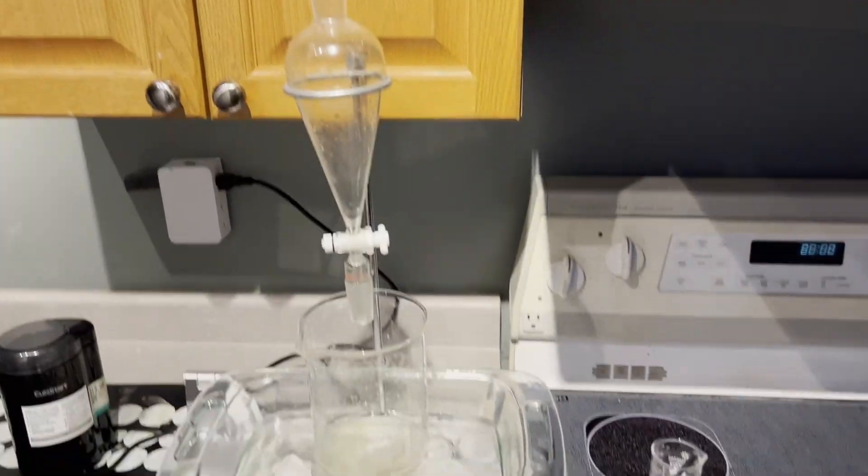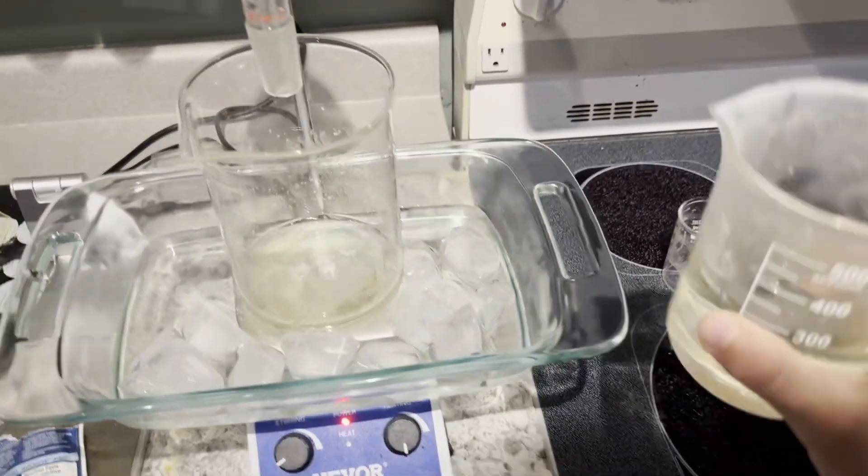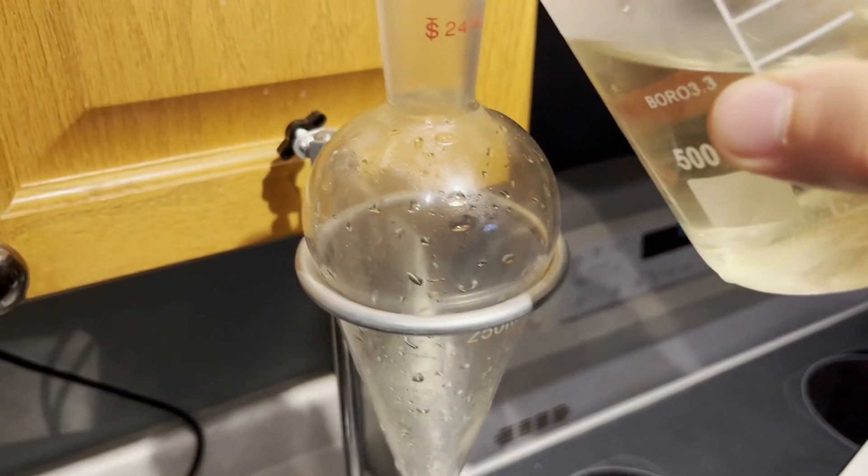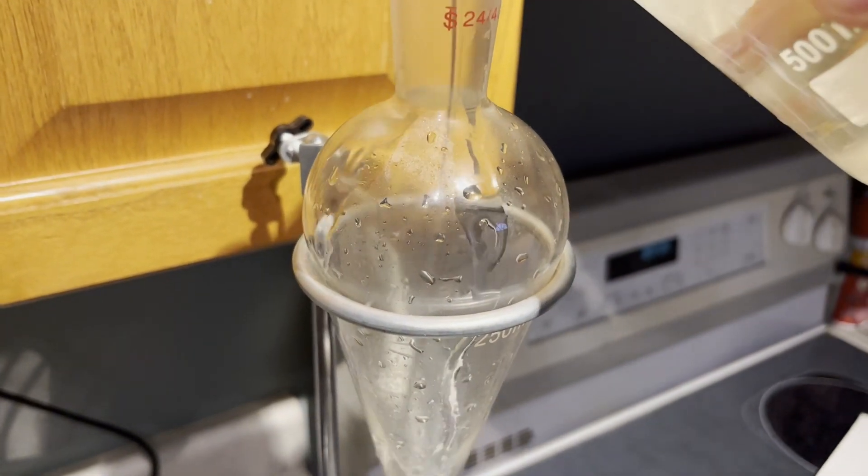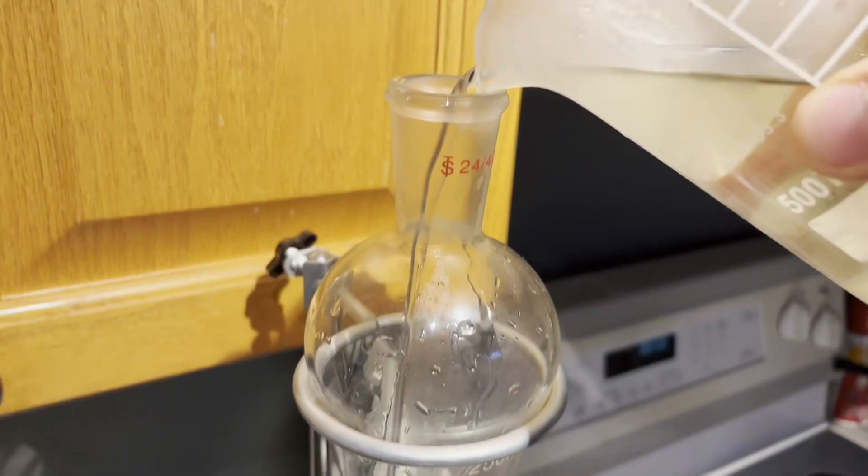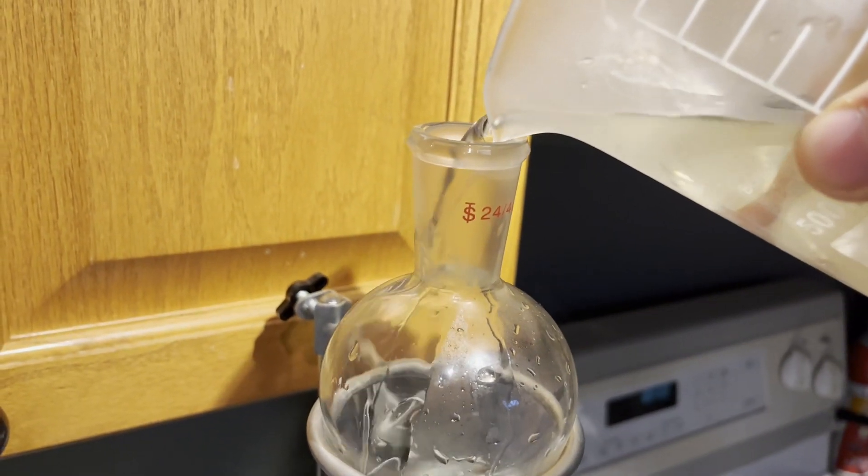Once dissolved, the solution is placed into an ice bath and the temperature is brought below 10 degrees Celsius. The basified bleach solution comes out of the freezer at a temperature of about negative 10 degrees Celsius and is added to the separatory funnel.